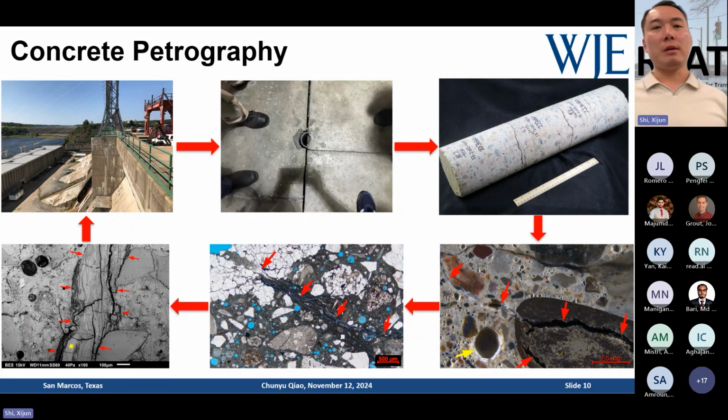Also, we want to do some microscopic or petrographic analysis to document the current condition of the concrete after so many years. Normally, we get a core, and like I said, after we receive a core, we do a visual inspection of the condition of the core laid out over there.